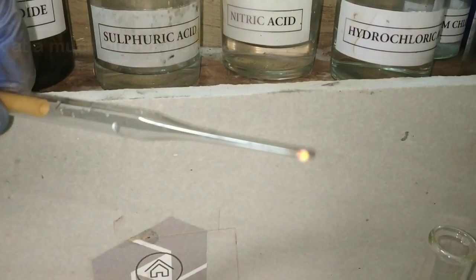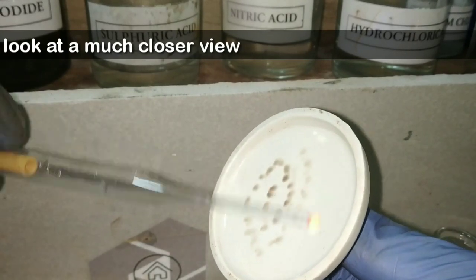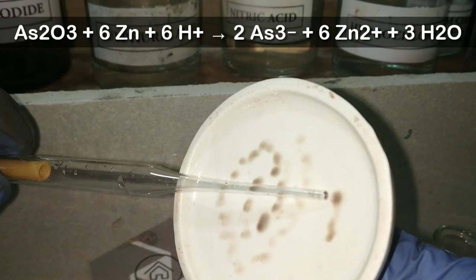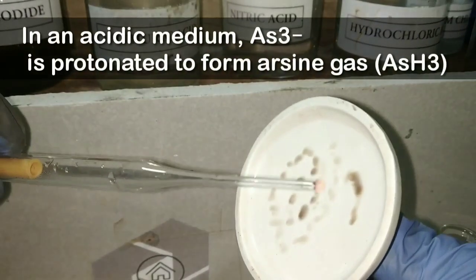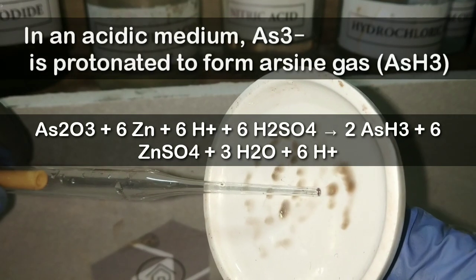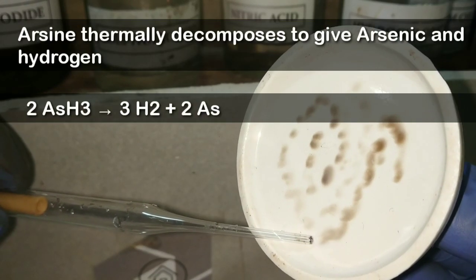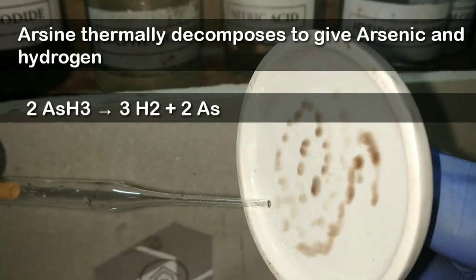That is why this test is used in forensic analysis for detecting the presence of arsenic poisoning from the stomach contents of the suspected dead person. The chemical reaction goes like this: arsenic trioxide reacts with zinc and H⁺ ions to form the arsine gas. Initially in acidic medium, As³⁻ is formed, which is protonated to form the arsine gas. Later, the arsine is decomposed thermally to give hydrogen gas and elemental arsenic.